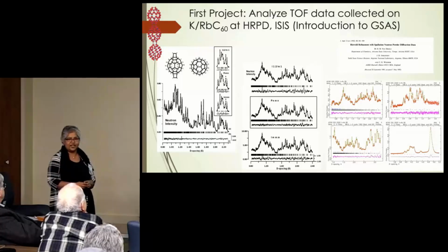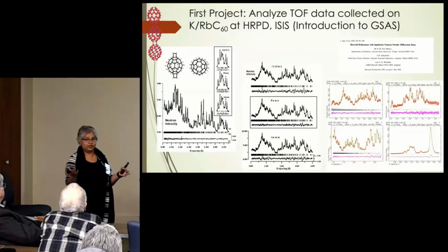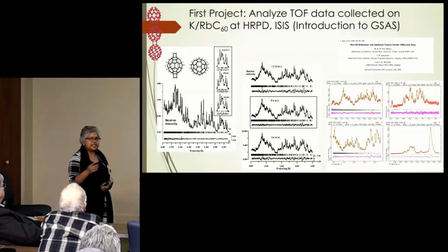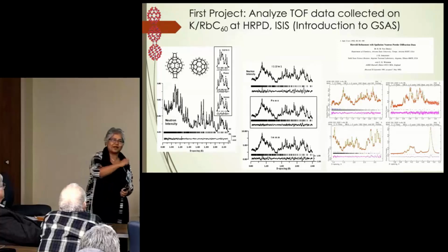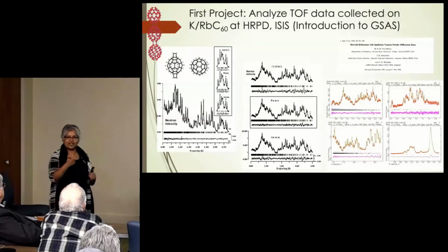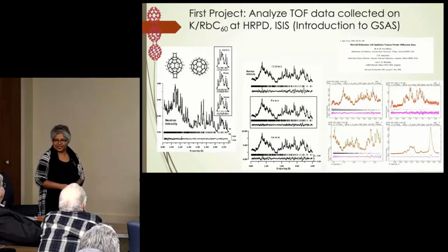I said, OK, great. What do I use? Because I couldn't figure out how to do time of flight with FullProf. And he said, Bill David had some codes, but it's very hard to understand how it works. You might want to try GSAS, and here's a copy. So I saw a lot of people show the copy of the GSAS manual. That's how I learned GSAS as well.